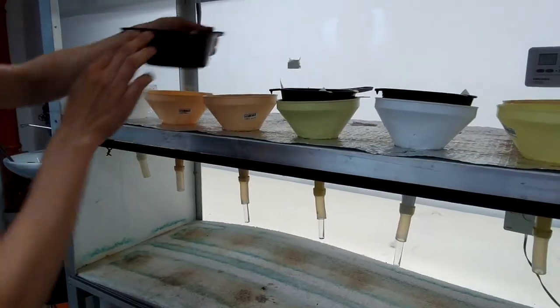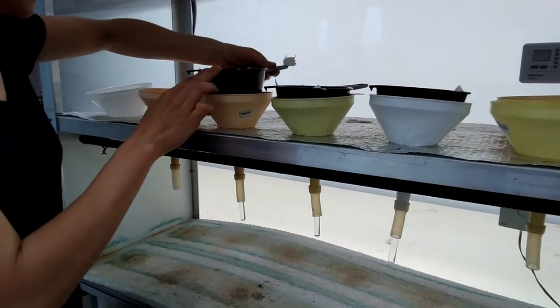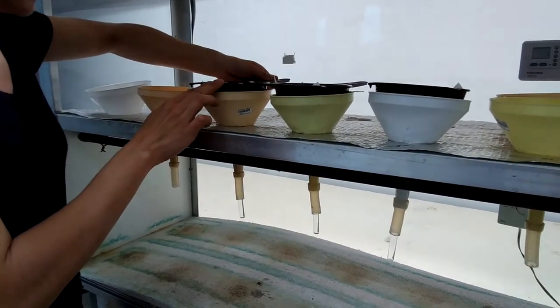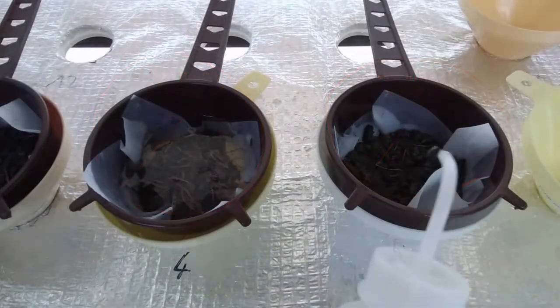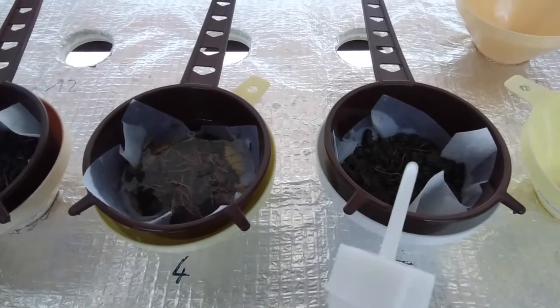Gently place the sieves with soil and litter on top of the funnels. The substrate should be fully soaked but not submerged completely. Add more water if needed but not too much.